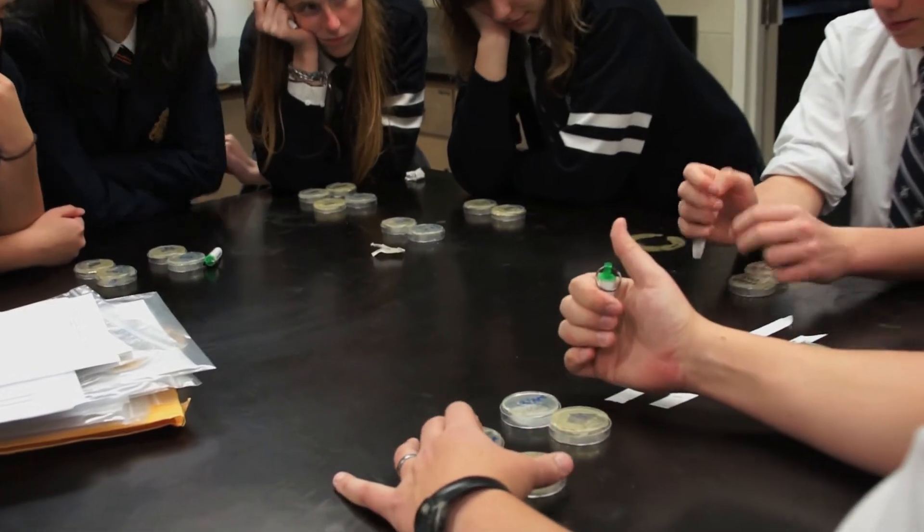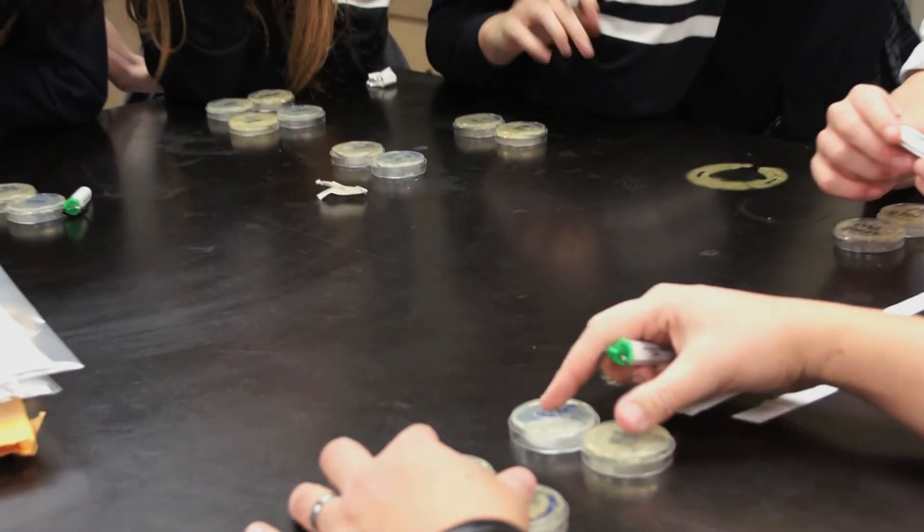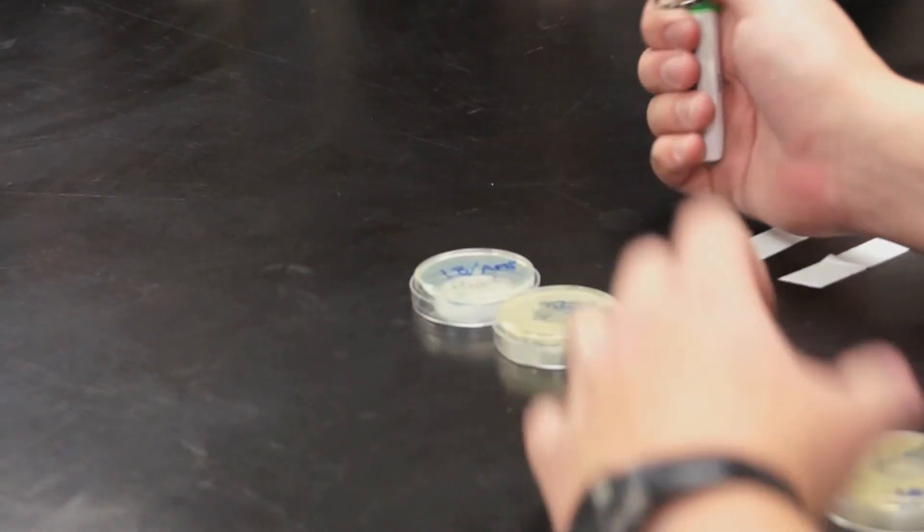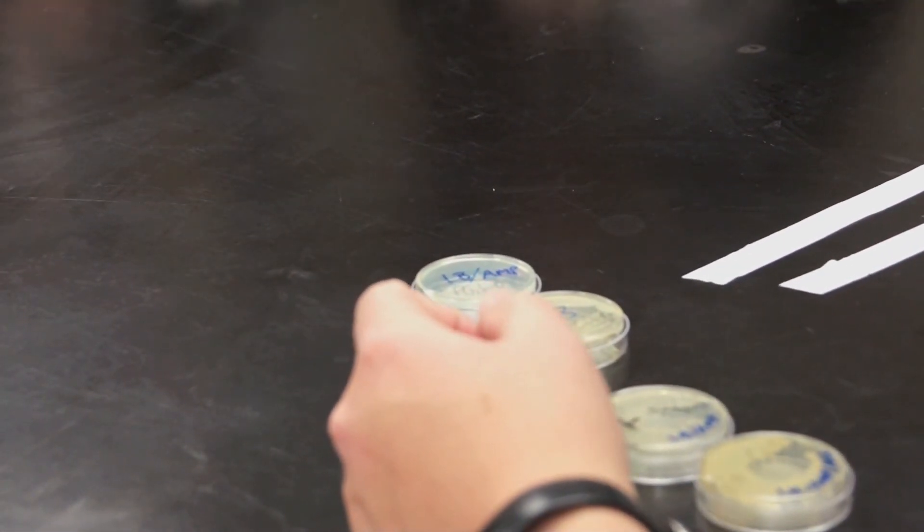Good job. Now we are going to have to look just at your plus plasmid plate. Cosmo, could you get the lights? And then we're going to look at our plates. Thank you. How are you doing?